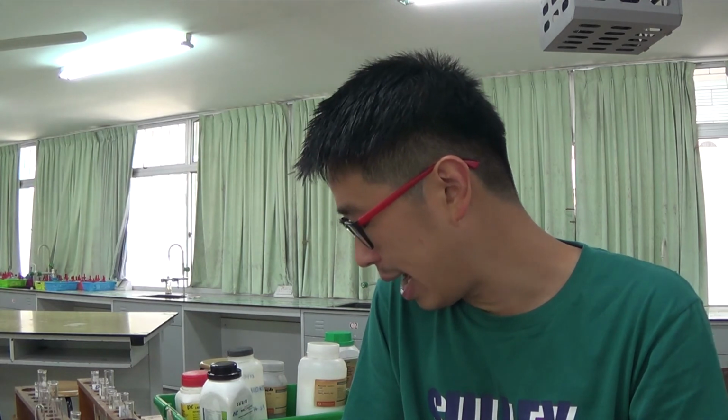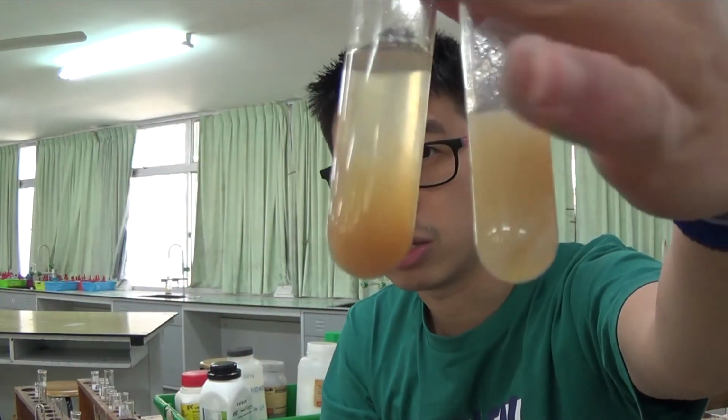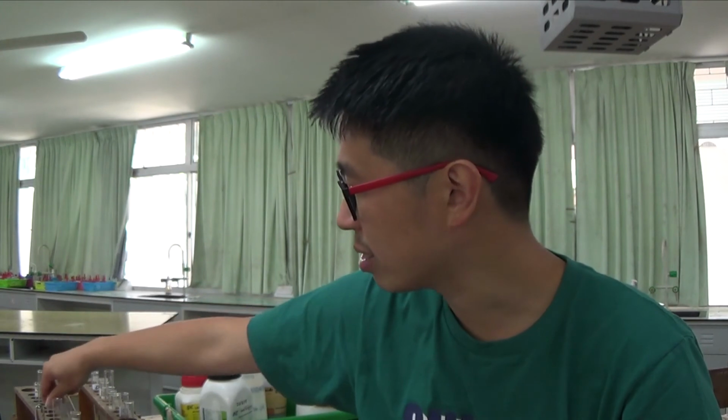The last one I did was also A-level paper 3 cation. There's the manganese 2 or Mn2+, and it gives you that off-white precipitate. Looks like white at first, but I think within 5 seconds it has already gone off to this color. So this color is not white precipitate, it's an off-white precipitate. Both of them were insoluble in excess of NaOH as well as in excess of NH3.